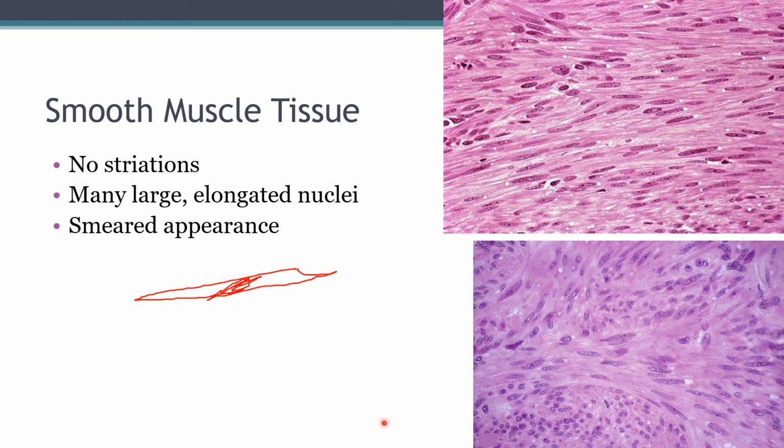So this spindle-shaped cell is actually coming out of the screen at you here. And basically what you've done is cut it down the middle like that so that it looks like a bullseye. And so that's why this looks different. It's really the same thing. It's just that you cut it in a different way, and so the cell looks a little different.